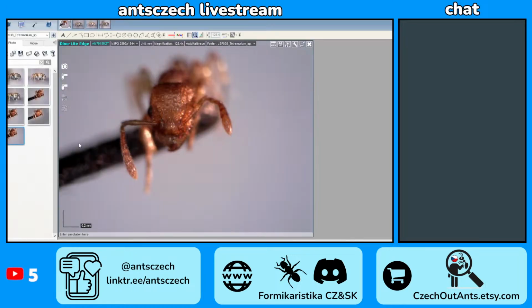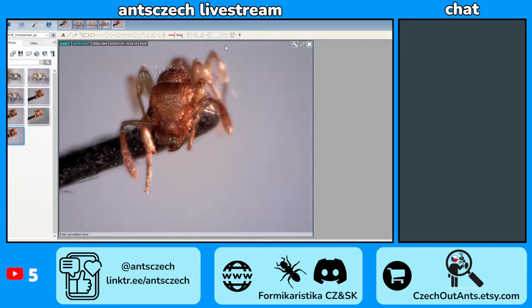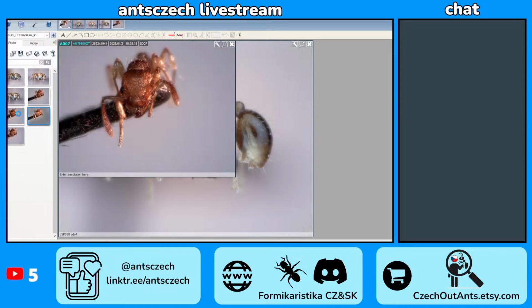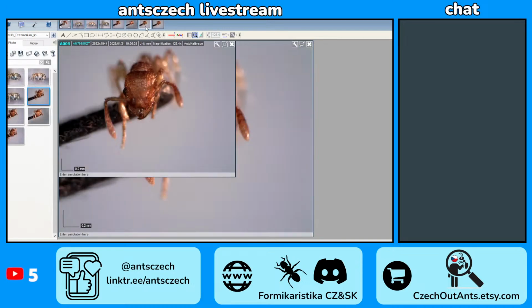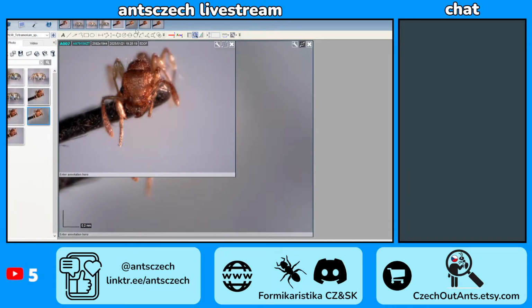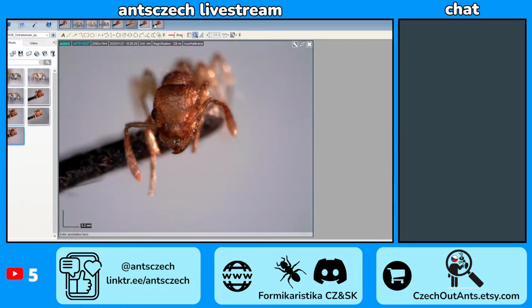If the measurement is gone for good, then it's better than if it's a wrong measurement, because at least you know it's gone. But if it's a wrong measurement, it's hard to figure out. I can always remeasure it, because the picture in the app still has the magnification set and the calibration and everything, so I can remeasure it afterwards. But even then, if it changes in time, it's unreliable.